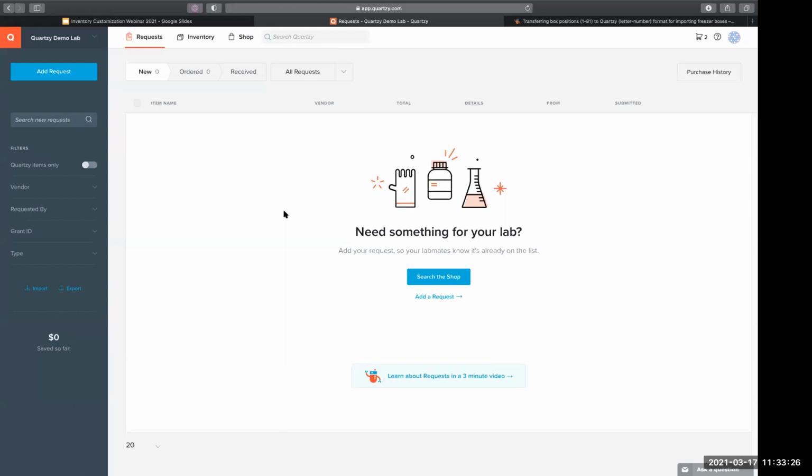Yeah, I mean, that's definitely good to know. I'll definitely be bringing this up with our product development team. This has definitely been something that's been asked about before. It is on the pipeline or the roadmap for this year, but I do not have an exact timeline on this yet. So let me go ahead and get with our product development team and see if we can get a timeline, and we'll email that out to you guys.